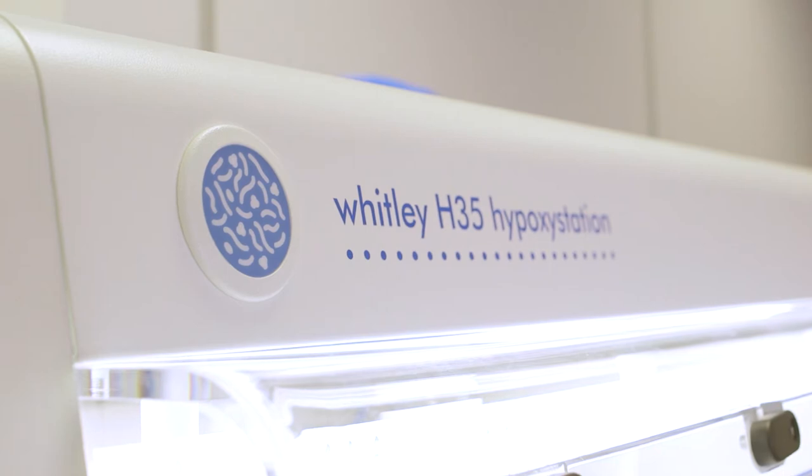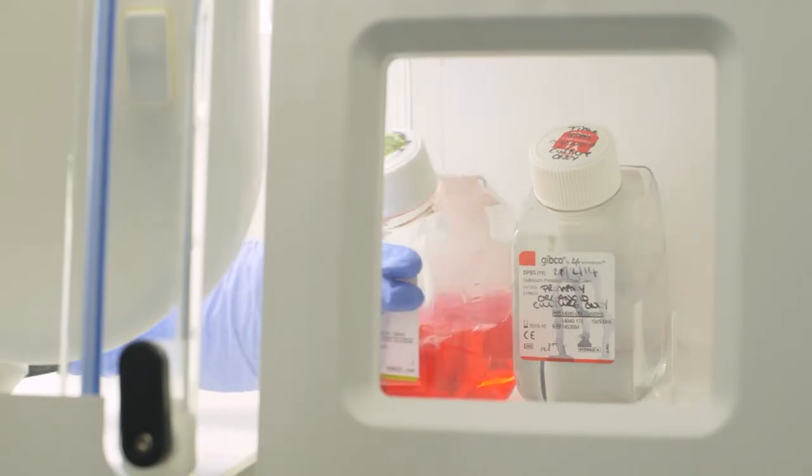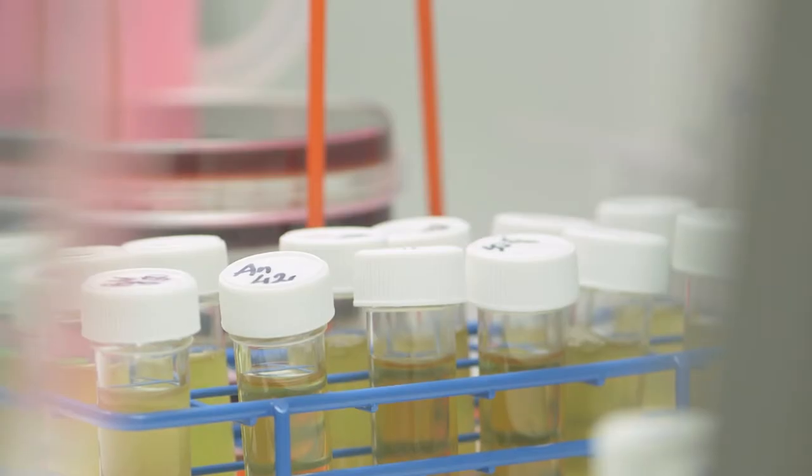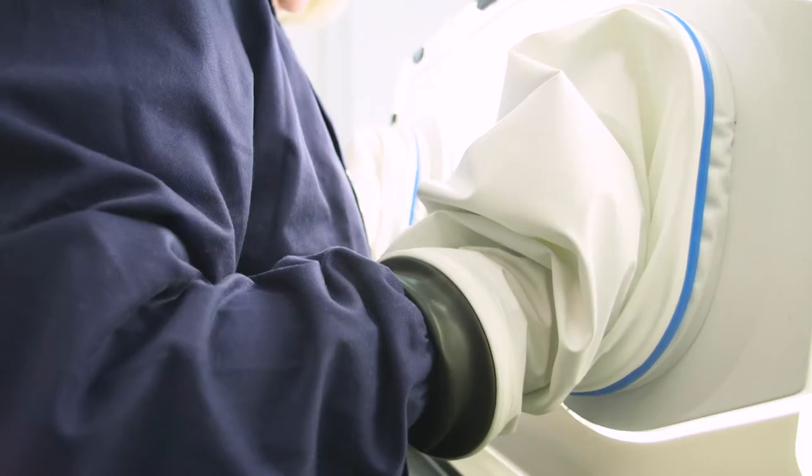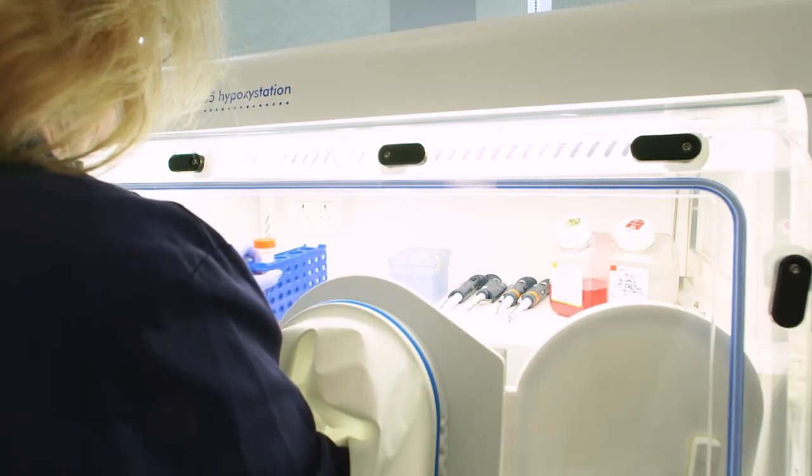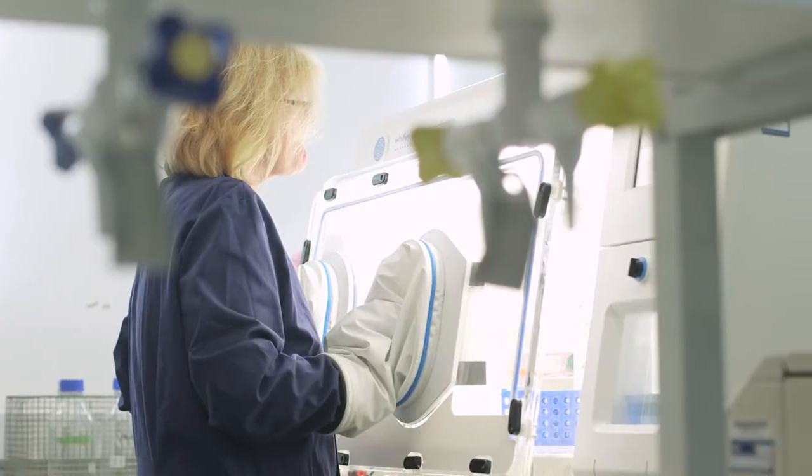So I treat them with inflammatory stimuli and so on and I measure the gut permeability using special equipment that I actually take in through the side door so that I can actually do experiments inside the environment. So at all times the cells are kept at the environment that they would normally expect to be grown in and I think that's really important to produce results that are more relevant and more useful to other researchers who work in gut inflammation.